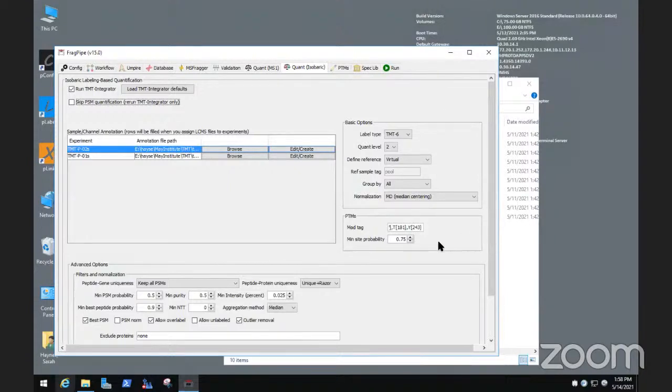And I think in general, it works so well with ddaPASEF data, and diaPASEF data is still challenging for the untargeted DIA-Umpire direct DIA approach. I would probably recommend using ddaPASEF data for generating the spectral libraries for downstream analysis using, say, DIA-NN.